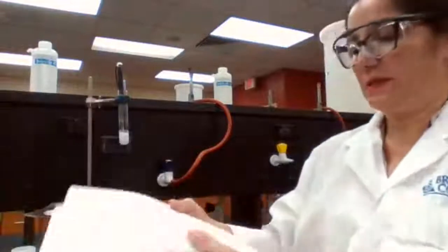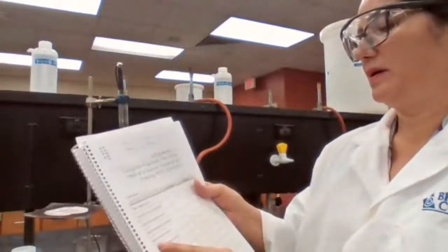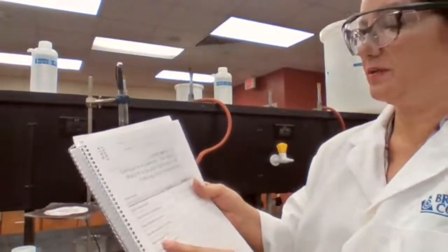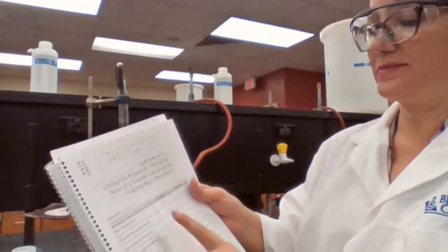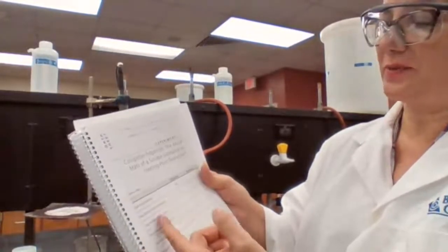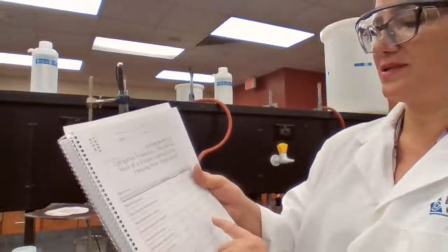From the data sheet, you have the mass of the unknown, and the letter for the unknown was unknown C. You have the mass of the benzophenone in kilograms. So you basically subtract the mass of the test tube from the mass of the test tube plus the benzophenone. You get the mass of the benzophenone. You have the mass of the unknown.